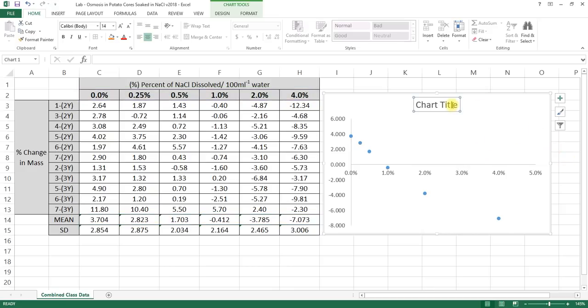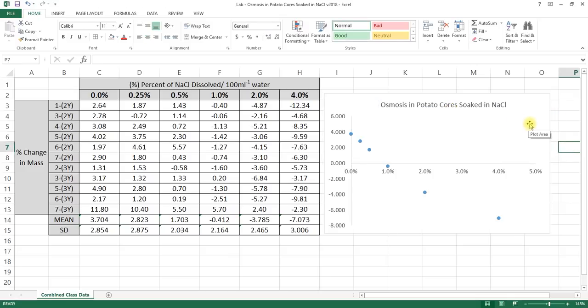Well, let's go ahead and give your graph a title here, and we'll call this something descriptive. All right. So a good title is something that talks about what exactly is happening there. And generally speaking, it's going to have your independent and dependent variable in there as well. And we can come over here and change the size of our title because we don't want it being too obnoxious. So let's go ahead and put our title right there like this. Okay?